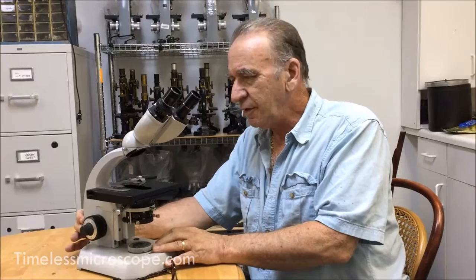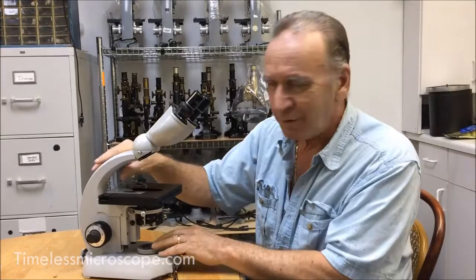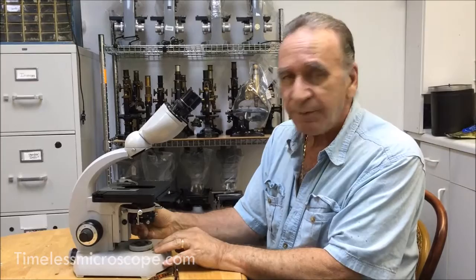Hi, I'm the owner of Timeless Microscope. We collect these old German microscopes which we consider the finest ever made because I spent years doing this, and people are afraid of these things and they don't need to be. They are very German, which means they come out in their own way.